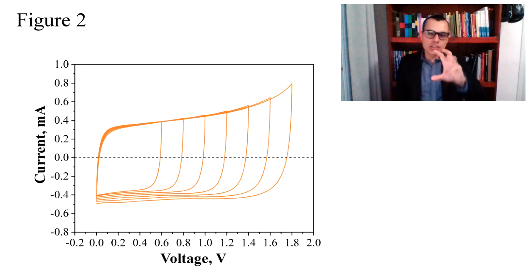This setup is the optimal point between scan rate and acquisition time for a quality Raman spectrum. This slide shows cyclic voltammetry proving the excellent electrochemical behavior of the cell used in the Operando studies.